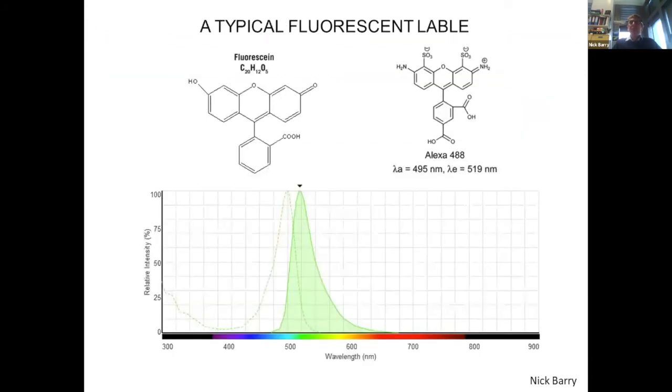So what we're using are basically fluorescent dyes. They're molecules like this, a bunch of benzene rings, and they've been tinkered with. Probably this would be a first generation molecule, something like fluorescein. Alexa 488 was a modified version, might be a second generation version of a green dye, and probably now we're on third generation. And what they're doing is really playing around with the side groups in order to improve their resistance to photobleaching or change the way they can permeate membranes and things like this. So they are still being adapted.